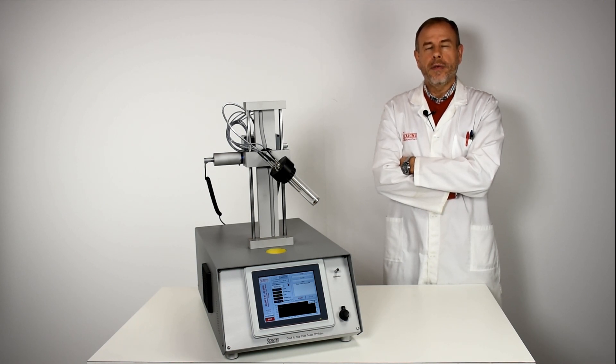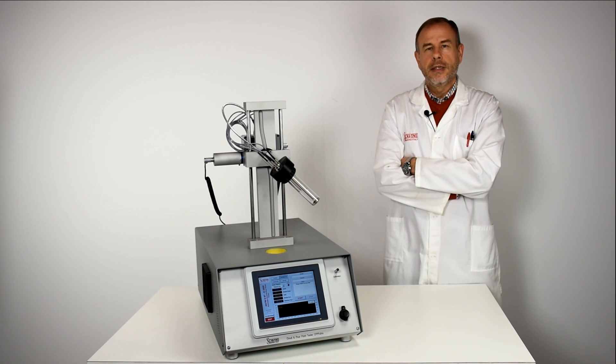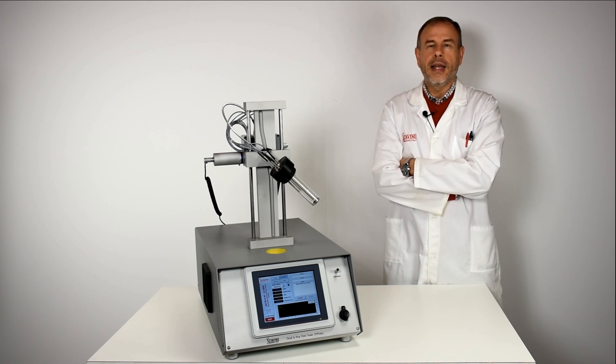It's the evolution of the previous equipment and now thanks to a powerful sterling cooling compressor, the jacket can reach temperatures of minus 120 degrees. The instrument is also completely CFC and HCFC free and needs only 300 watts to operate.